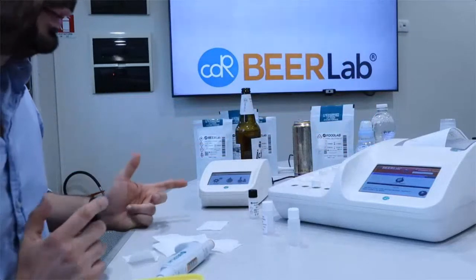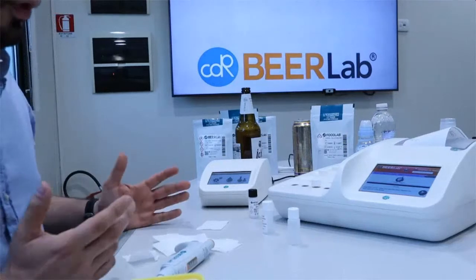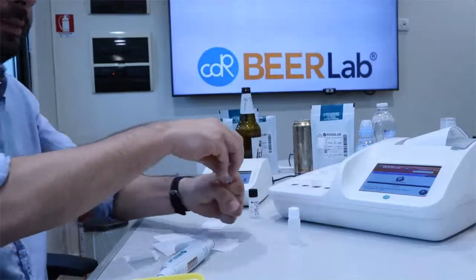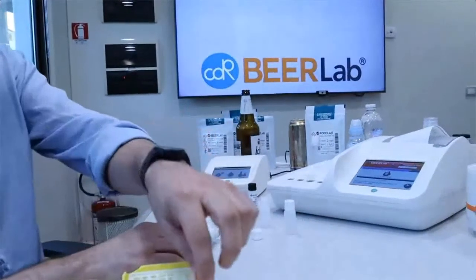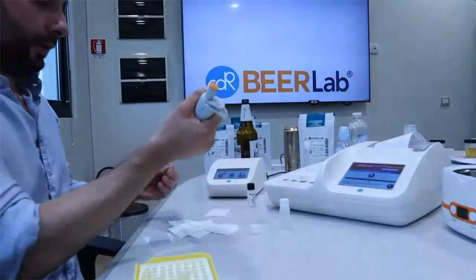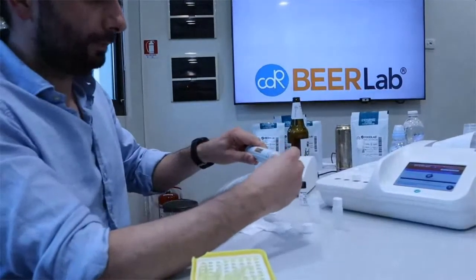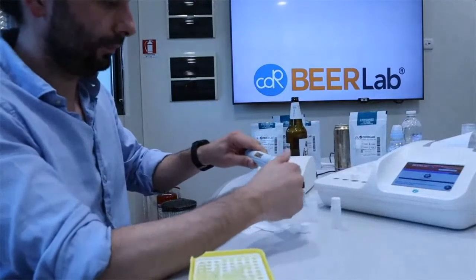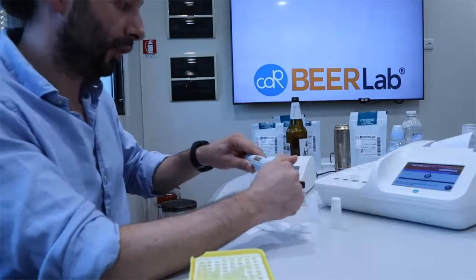Now you have to add 50 microliters of R2, shake, and start the timer. So we do the same operation. So as you can see, for all the analysis, you have to use a single pipette. Here we change the volume to 50 of the reagent.